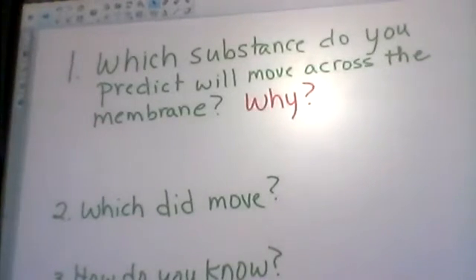And why do you think IKI? Okay, the other did have a little bit of floaty stuff in it that gave it that color. Why did you guys think cornstarch? We have no idea. All right, let's go.